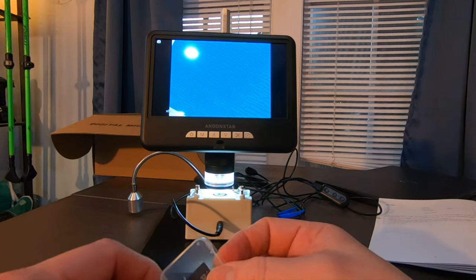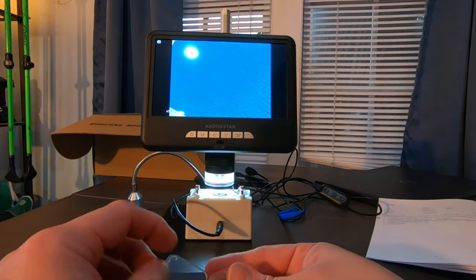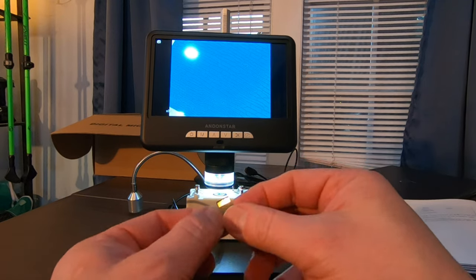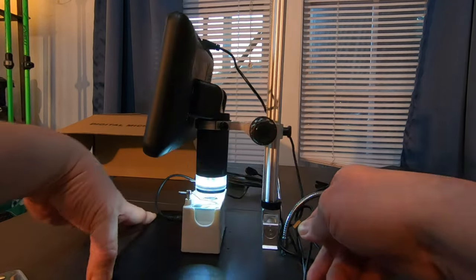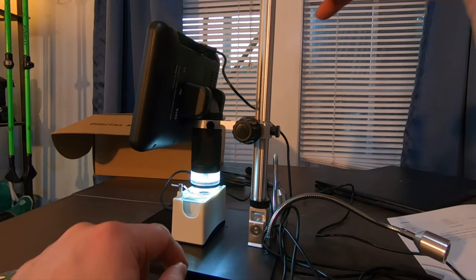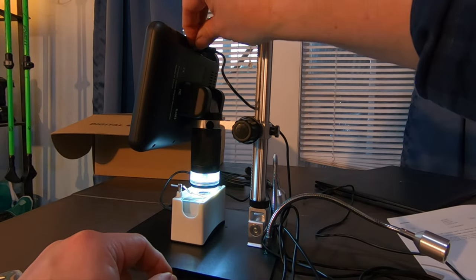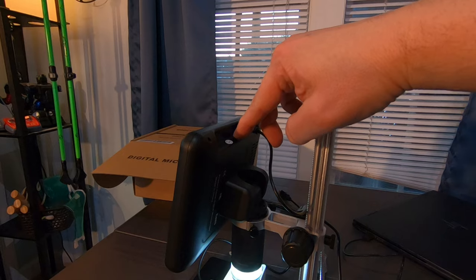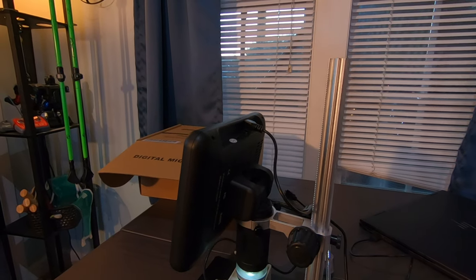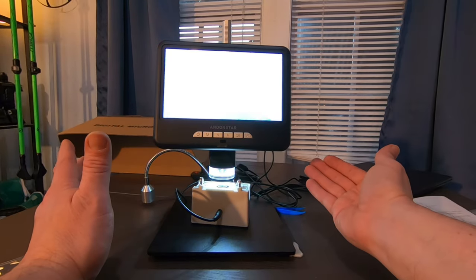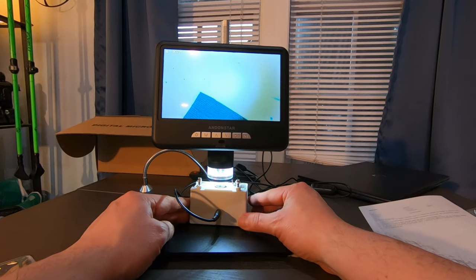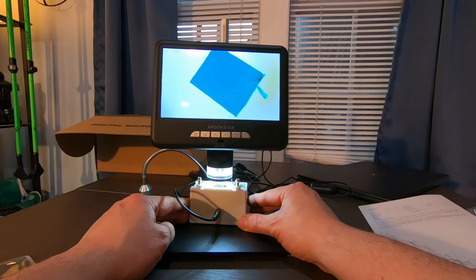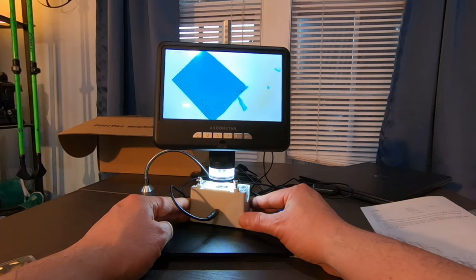Now, if I want to take a picture of this. Take out my SD card. 32 gigabyte card. I'm going to turn it around. There's a slot right here at the top for my SD card. I'm going to slide the SD card right on in. SD card is now in. Alright, so when the SD card is inserted, it looks like, I guess you have to turn off the unit when you put in your SD card. That's so cool.